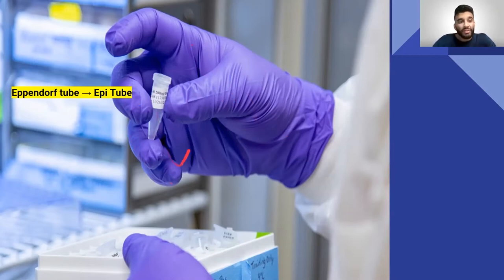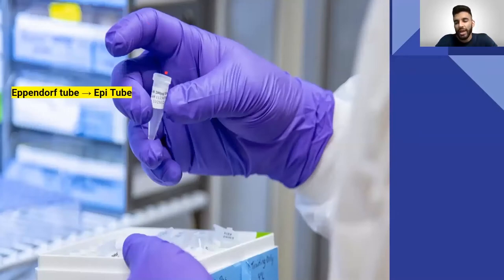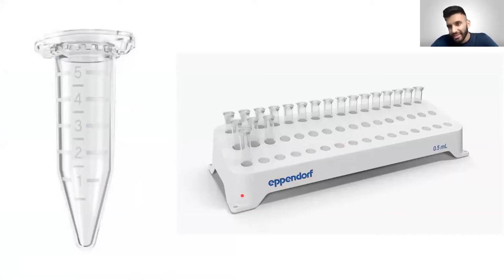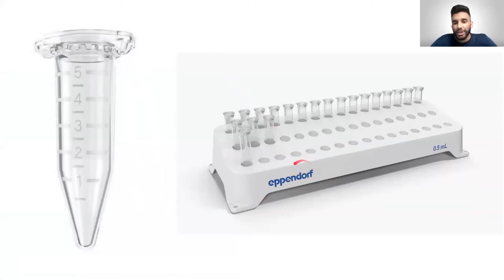Always wear gloves, and you'll use something called an epitube — the full name is an Eppendorf tube, but they're just called tubes or epitubes. These are tiny miniature tubes, real size — they fit in your thumb and pop open with a little cap. You can put DNA, proteins, reagents, or chemicals inside these sterile epitubes. You place them in tube racks, which keep the tubes upright so they don't fall over and spill. These tubes are used to transfer DNA, reagents, and enzymes.